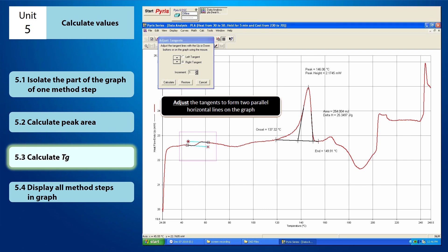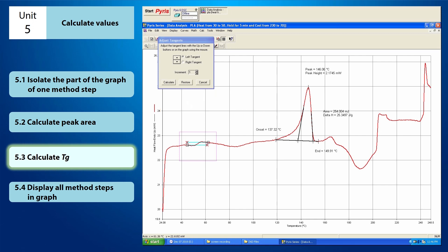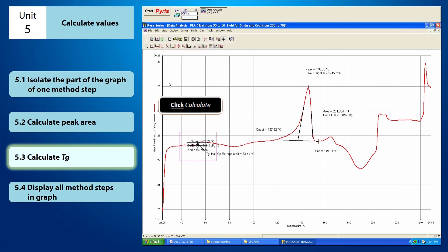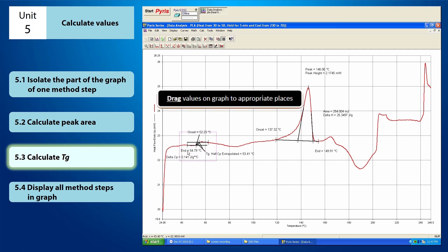From here, you need to adjust the tangents to form two parallel lines on the graph like this. Now you can just click Calculate. The values of the calculation will appear nearby the TG. You can drag the values to the appropriate places.